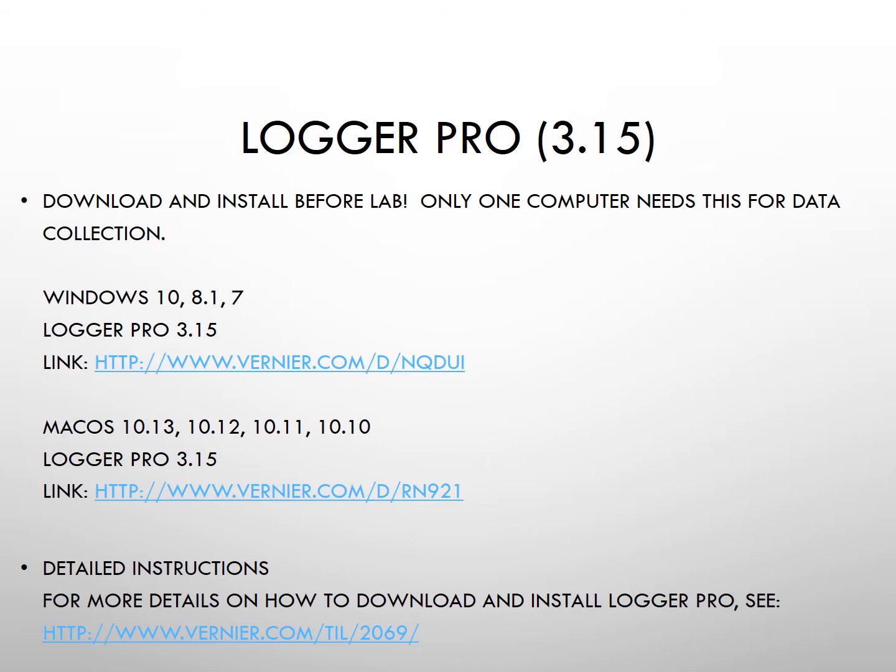This is a software program that we can use to collect data using some electronic probes, and then we can save that data directly to your computer for further analysis. At least one computer per lab group is going to need this software in order to complete the lab this week.